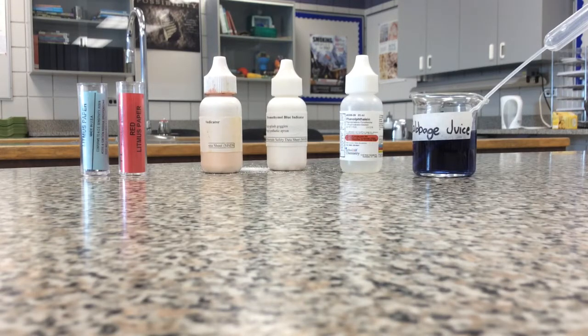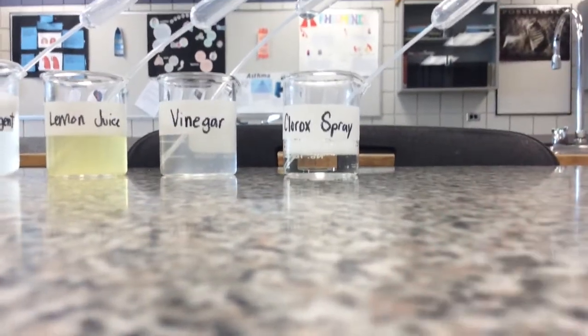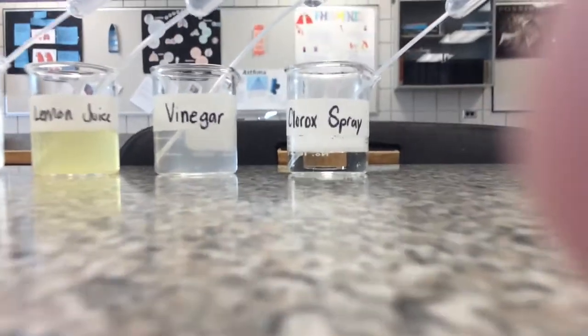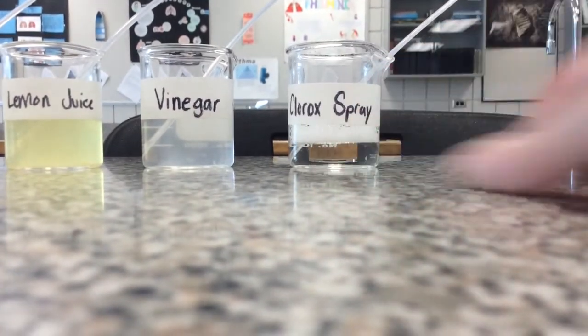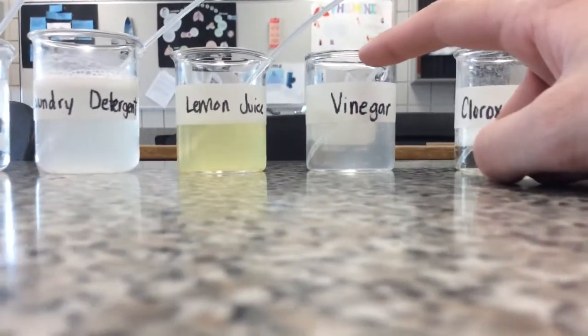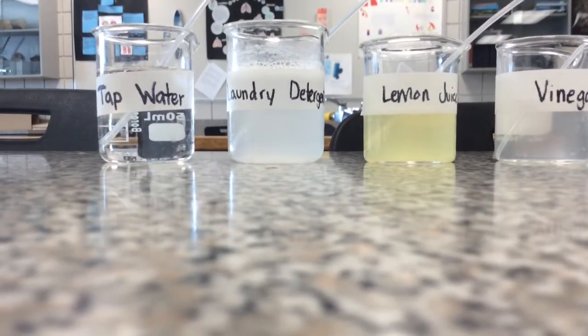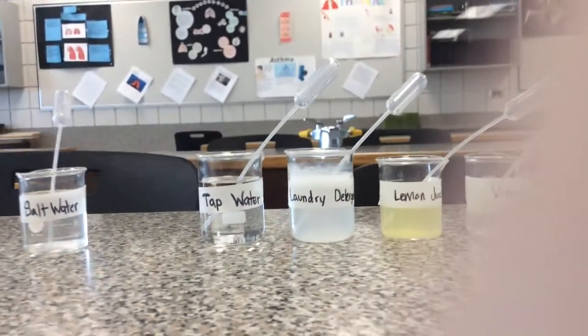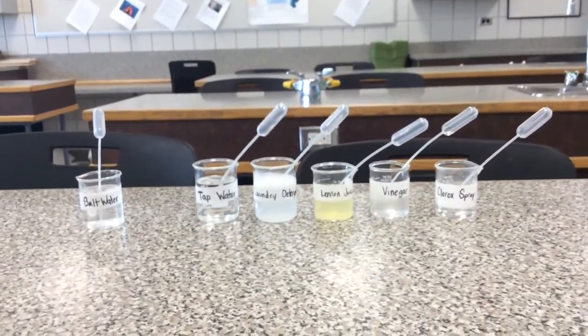Today we'll be using these 5 different indicators to test out some chemicals that you come into contact with almost every day. Hopefully you are using some of this right now. Some Clorox spray, some type of disinfectant. We've got vinegar, lemon juice, laundry detergent, tap water, and some salt water. So we're going to be testing today to see what those chemicals are.